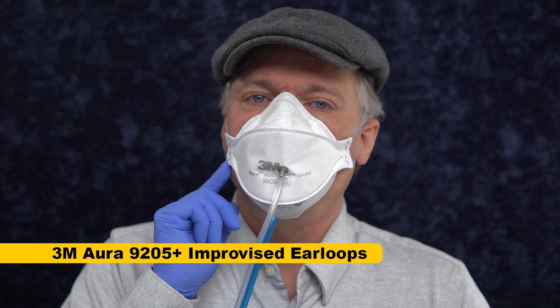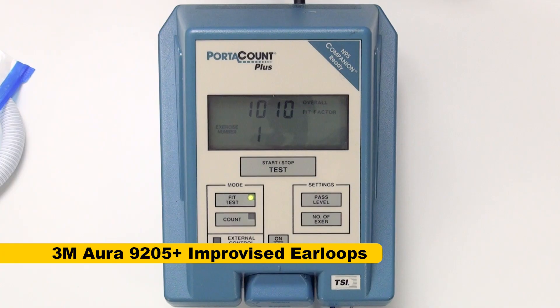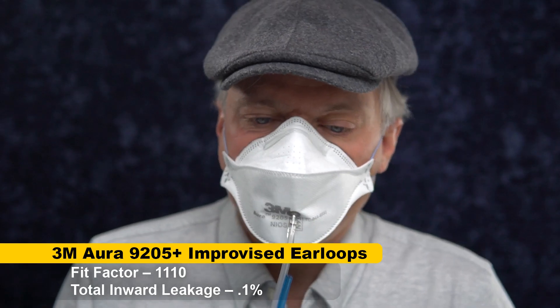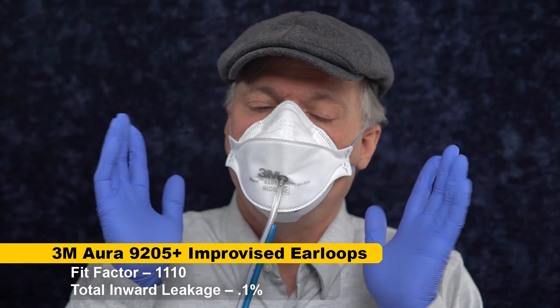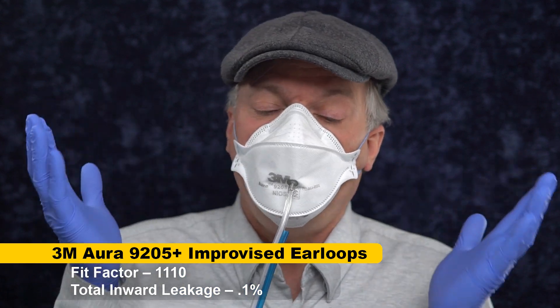This is the field expedient version with the ear loops tied out of the headbands, and we'll see how well it fit tests. Well, pretty much the same score — over a thousand. So on my face, with this particular mask, with some pretty tight ear loops that are kind of uncomfortable because I tied them a little too tight, I'm still getting great fit.